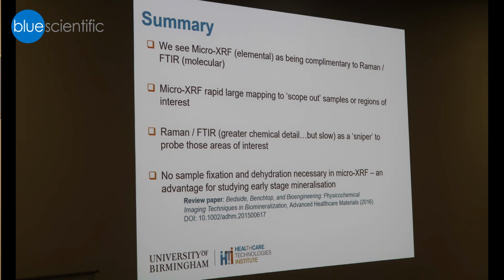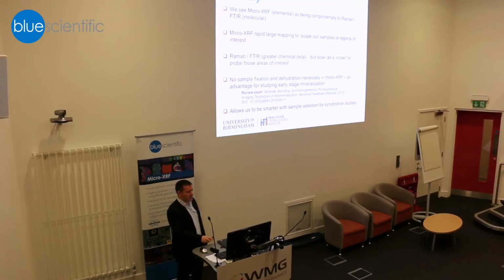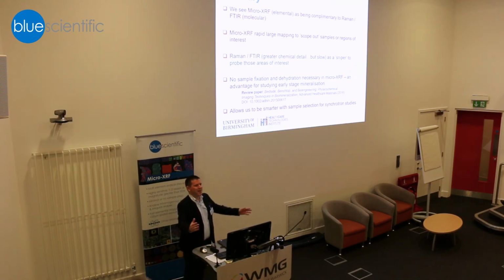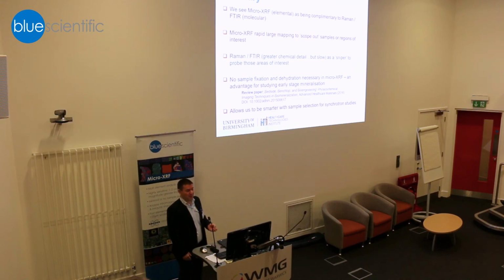We wrote a paper on our findings from some of the drawbacks we found in the area and how they can all work together over time. But going forward, again, XRF doesn't replace any technique. If anything, it allows us to work smarter. So we still use synchrotron XRF, we still do synchrotron diffraction studies, but XRF has allowed us to narrow down from 100 samples down to 3 really good ones and use our synchrotron time a lot more smartly overall.